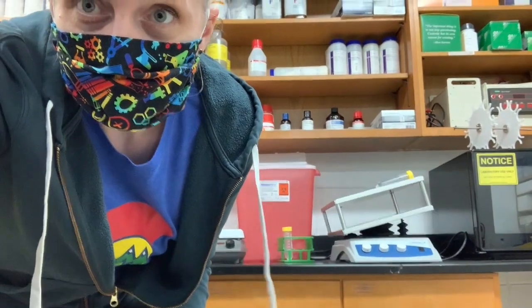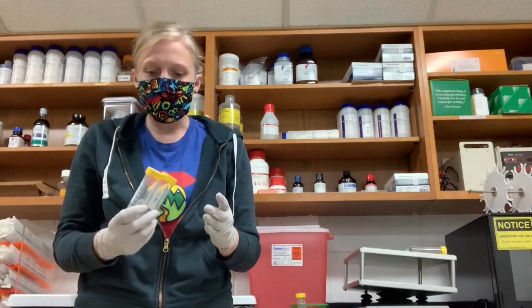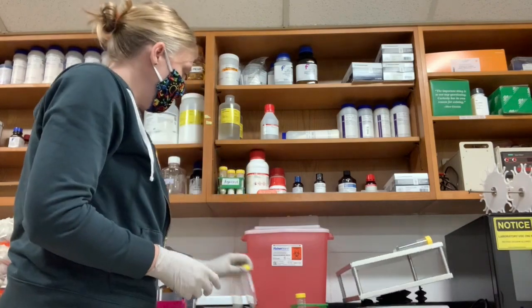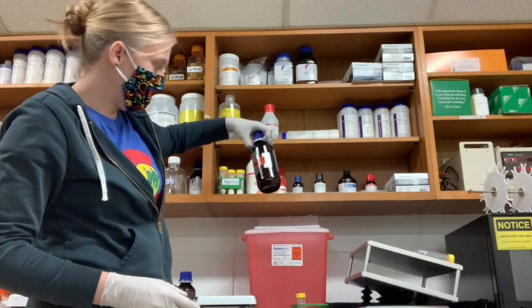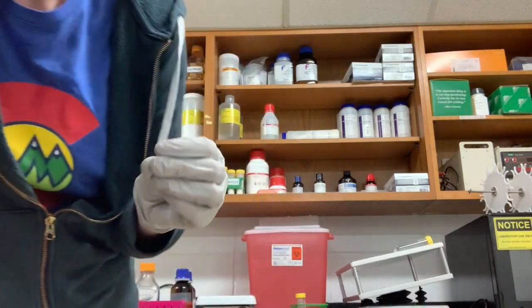So I've just moved down the chemical bench just a little bit, and you can see I put that solution on to shake for a little while. And next we're going to make 10% solutions of Triton X-100 and Tween 20. These are detergents and they're kept in bottles over here. It looks like this. And you'll notice that these are kind of sticky, so detergent is like a soap.